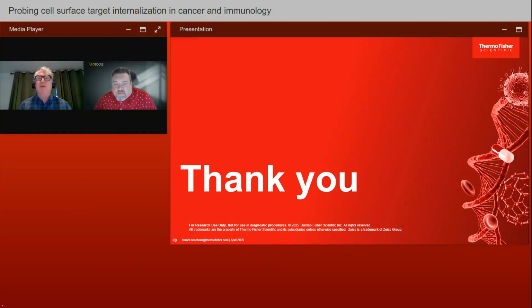These have a defined particles per milliliter in the vial that you receive. So we recommend titrating onto cells on the order of 2 all the way up to 100 particles per cell. Most cells work in the area of 5 to 20 or so. That really has more to do with the tropism of the cell as well as the endosomal escape of the message in the BacMam system.